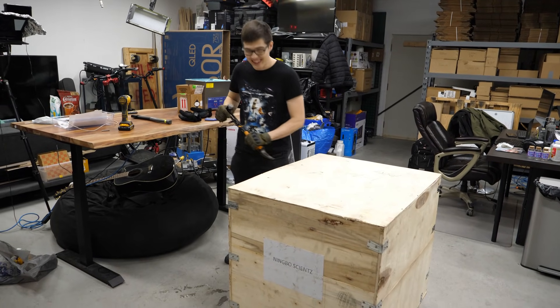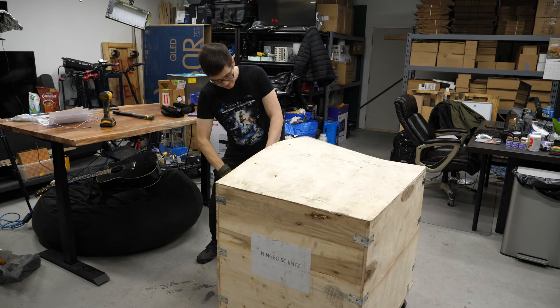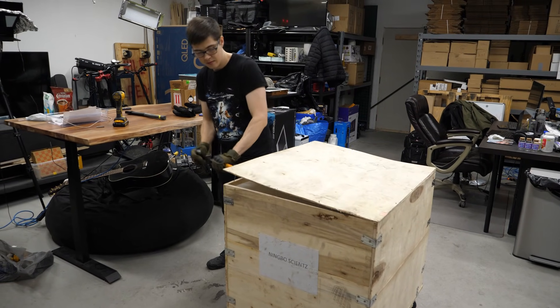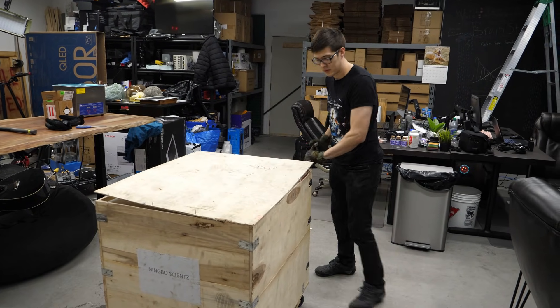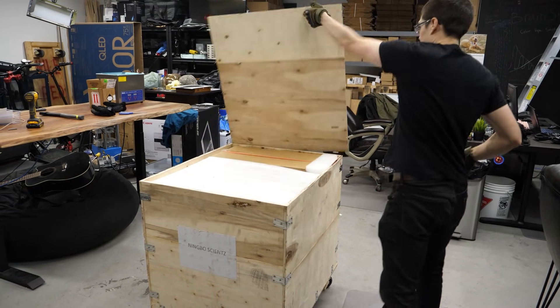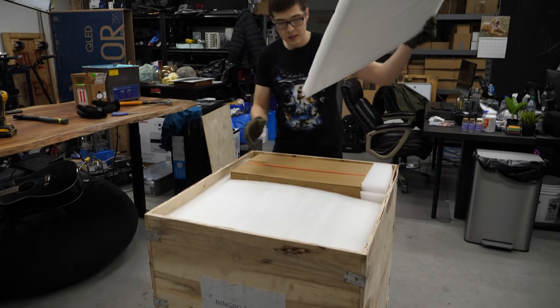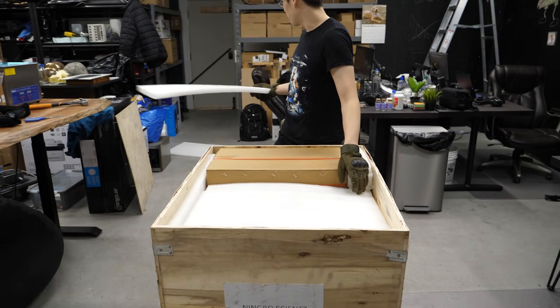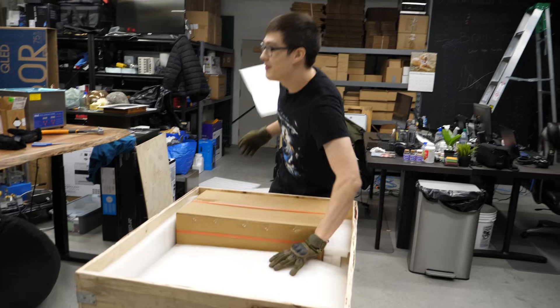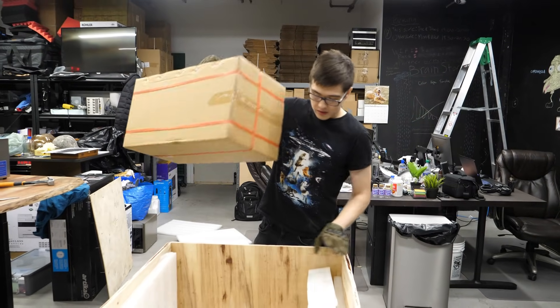Let's get this thing open. Something would just go in right away. What do we got in here? Foam. Foam. Foam. A box.